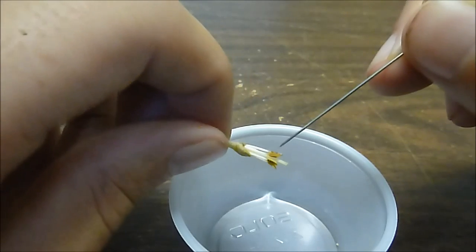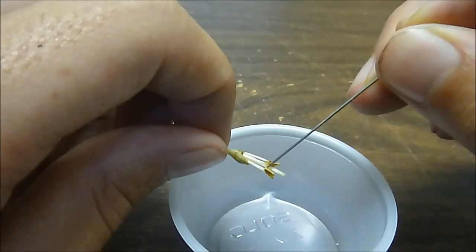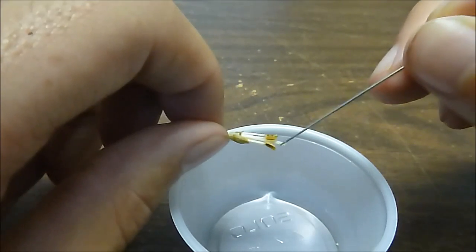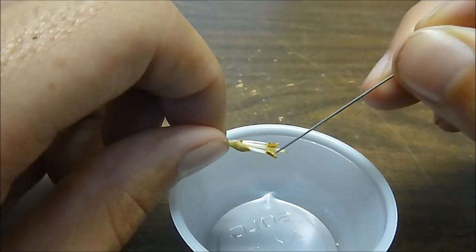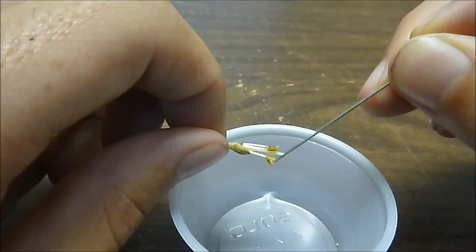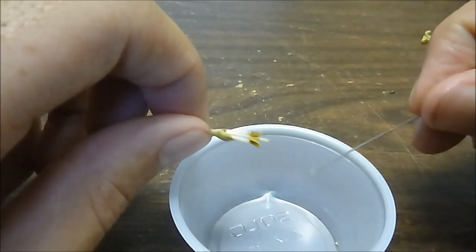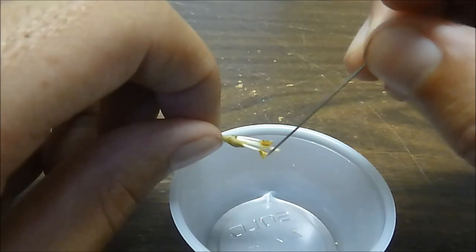Try to be very delicate with it, because sometimes you can get all the pollen to fall out in one long line. I've got some more pollen. It has fallen off, but that's okay — that's where we need it.